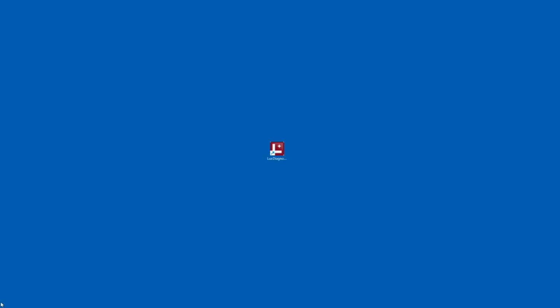This is a video demonstration showing how to access, log in, and use the Lux Diagnostics application powered by Shadowbox. The Lux Diagnostics app is provided to automate your lab orders and results through our client web portal, securely connecting your EHR through our HIPAA-compliant app.